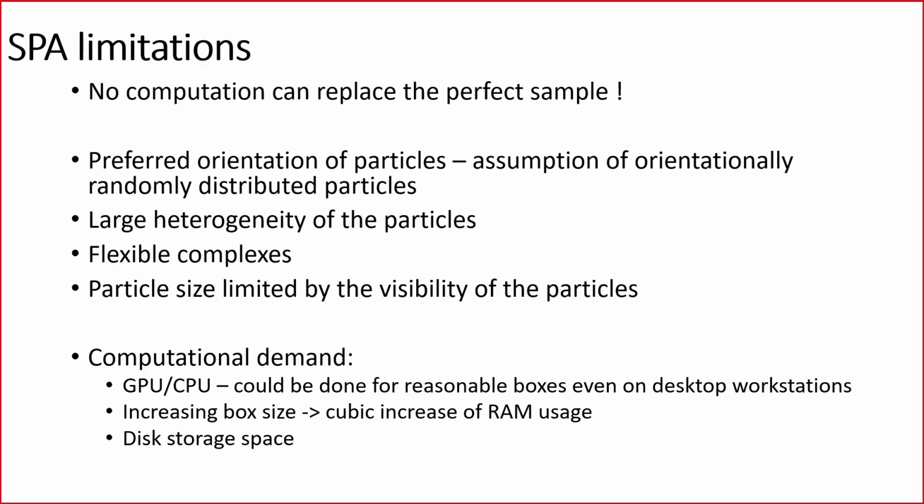The larger the box, the more demand on the random access memory, or the random access memory on the GPU, because by increasing the box size, the usage of RAM increases by the cube of the box size. And of course, all of us know that cryo-EM heavily uses disk storage because all our data sets are in terabytes. So this is also something that people need to be aware of.